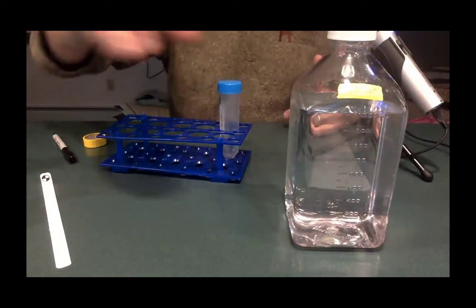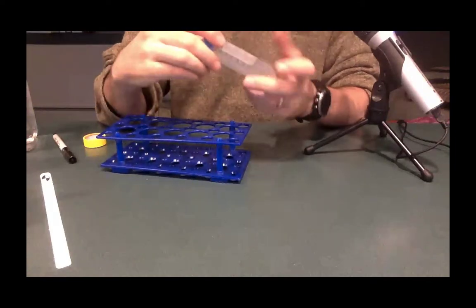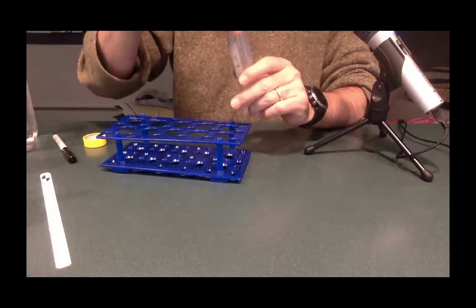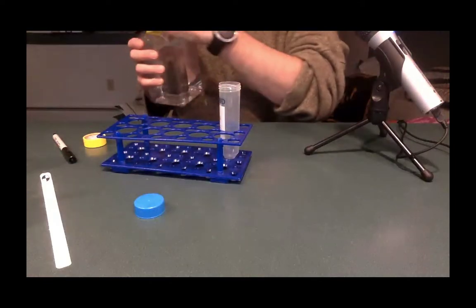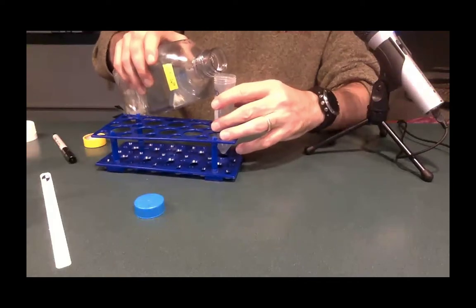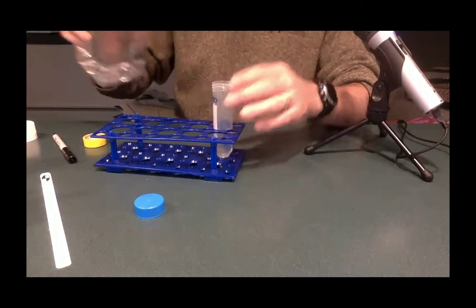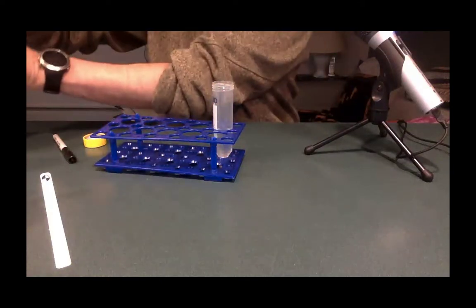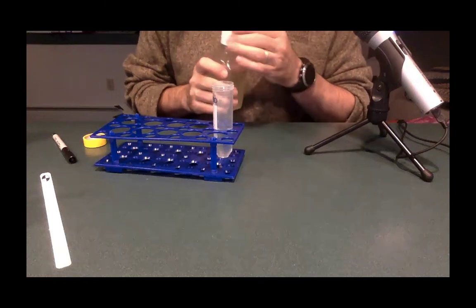So the first thing I'm going to do is add some water to it. And because I'm going to do a roughly 50-50 mix between my salt water and my algae, I'm going to add 20 mils of salt water to my tube. There are graduations on here. So this again is my salt water. I am going to add to the 20 mil line. Perfect. That's exactly where I want. And then I am going to reseal that, and add another 20 mils of my algae solution.